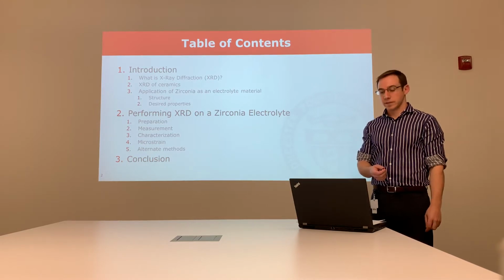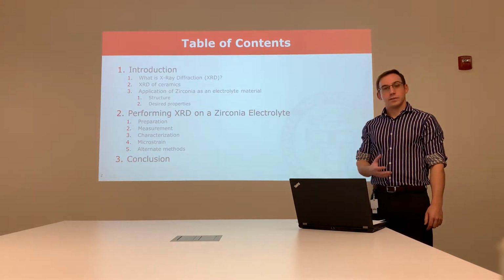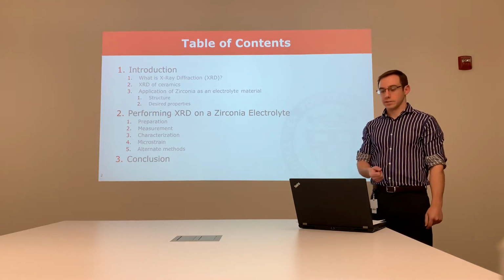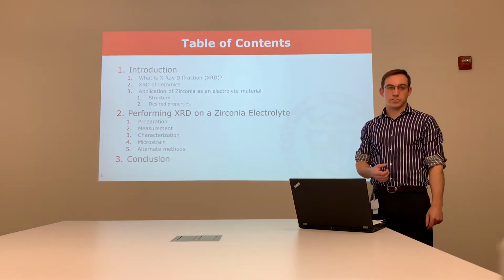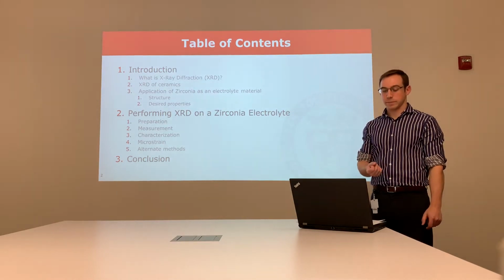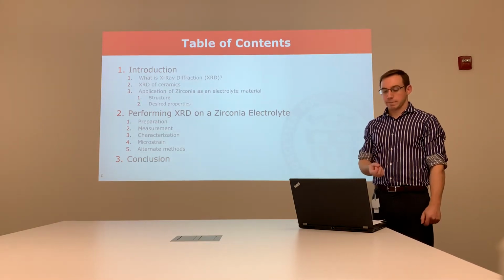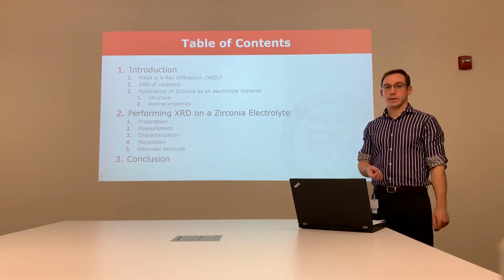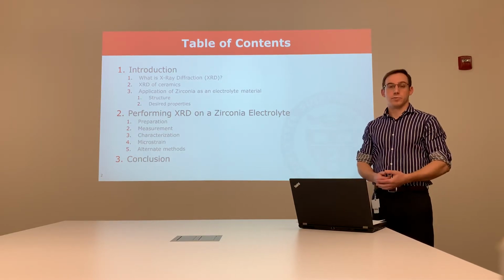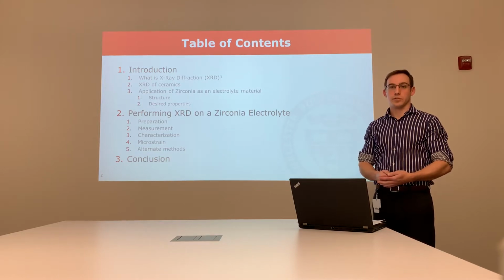Getting into the bulk of this presentation, I will be discussing how to perform X-ray diffraction on this zirconia electrolyte, starting with its preparation, followed by the measurement of the values through X-ray diffraction, the characterization of the data obtained, microstrain present in the material, and some alternate methods to verify our findings from X-ray diffraction. And then I'll wrap it all up showing how the X-ray diffraction data will tell us how this electrolyte will perform when it's put into use in a fuel cell.